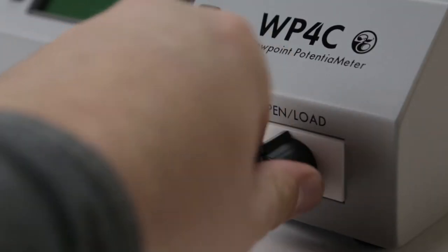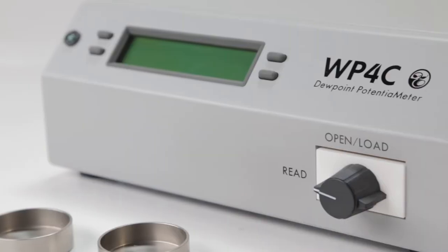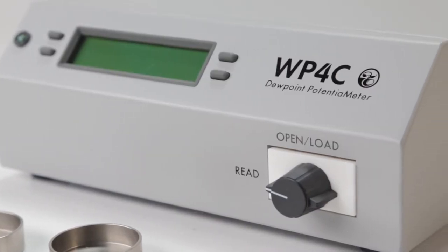We also redesigned the chamber with a new hydrophobic teflon-impregnated nickel alloy coating, which speeds up sample equilibration times. That faster equilibration means most readings take just five to ten minutes, and the WP4C now has a functional range up to about minus 0.1 megapascals with an accuracy of plus or minus 0.05 megapascals.